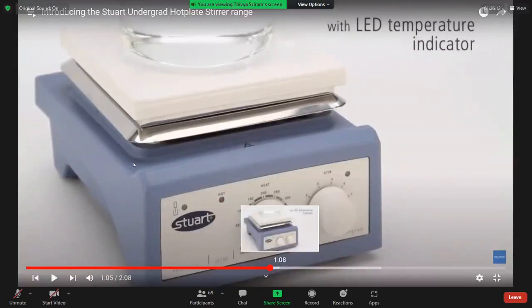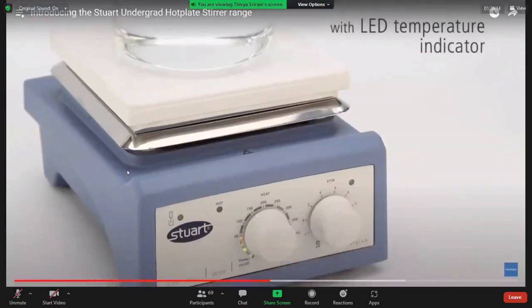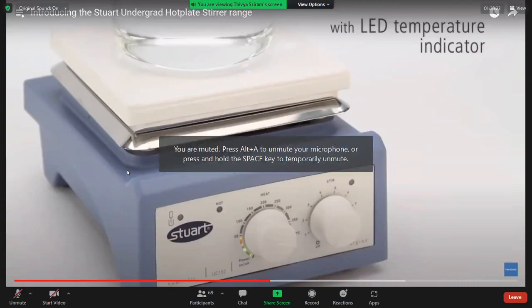Here we can set the speed of the magnetic stirrer, and if you want to use heat as well, we can set the heat option.